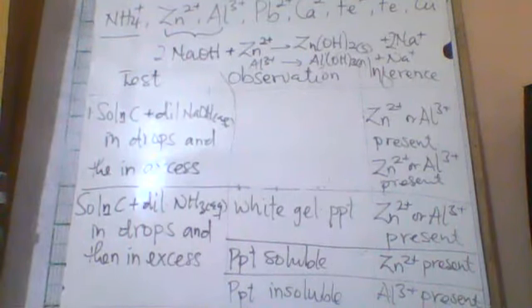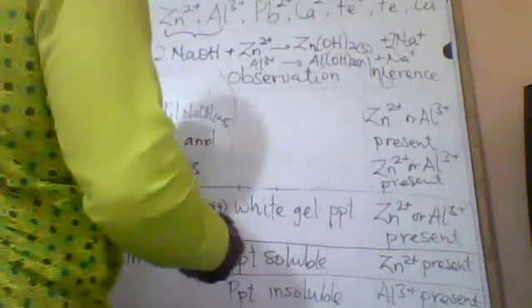Right. Now, let me move on to the lead and calcium, Pb2+ and then the Ca2+.